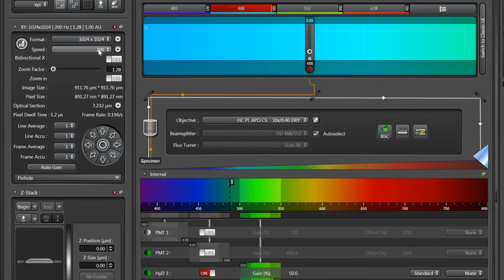If you're trying to look at the structure of mitochondria in a cell culture dish, you're going to need as high a resolution as you can get to look at some of the small organelles. In which case you're going to want to be on the high mag objectives and pushing that to the limit.